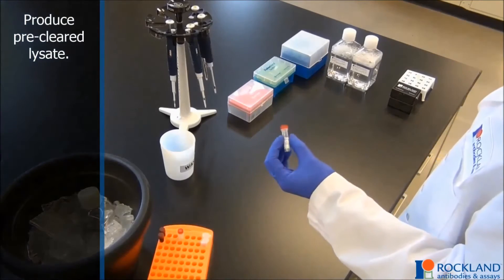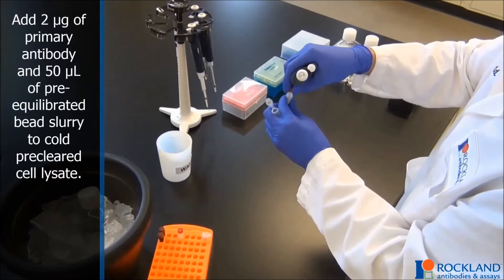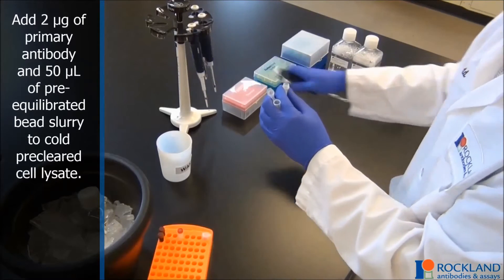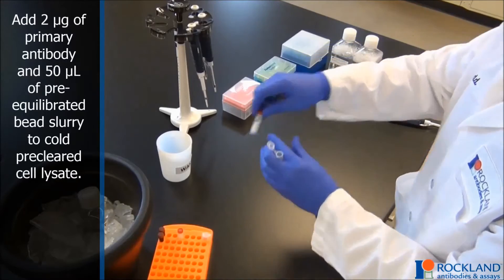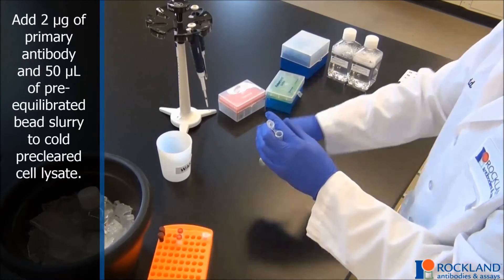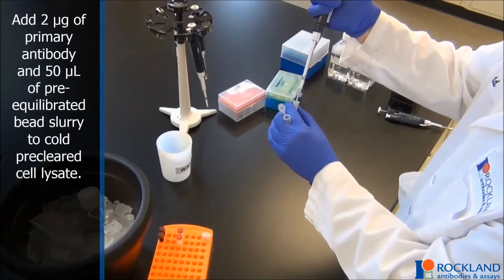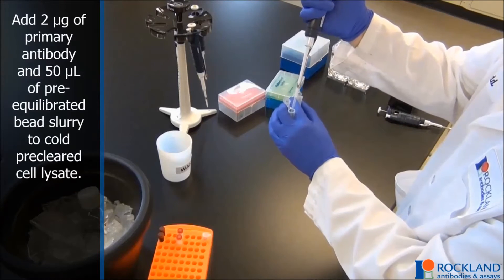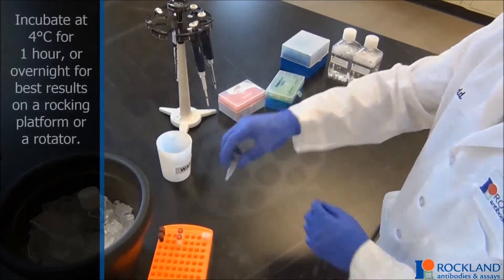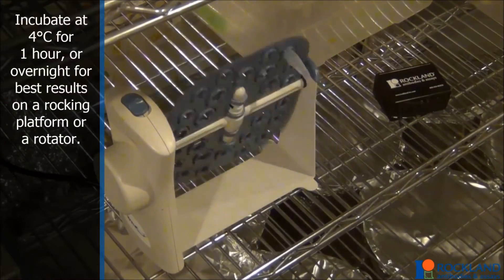Produce the pre-cleared lysate. Add 2 micrograms of primary antibody and 50 microliters of pre-equilibriated TruBlot IP bead slurry to cold pre-cleared cell lysate. Incubate at 4 degrees Celsius for one hour or overnight for best results on a rocking platform or a rotator.